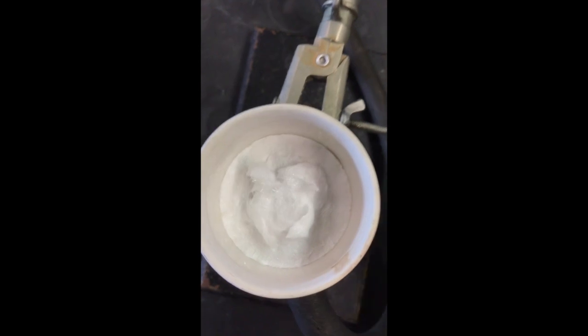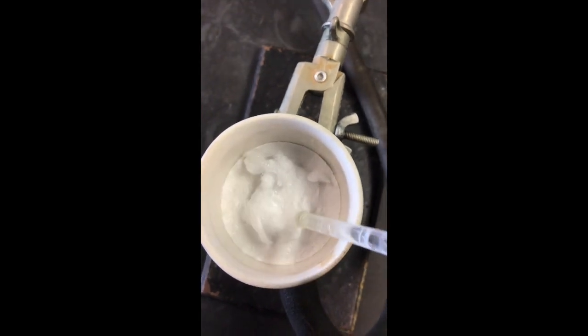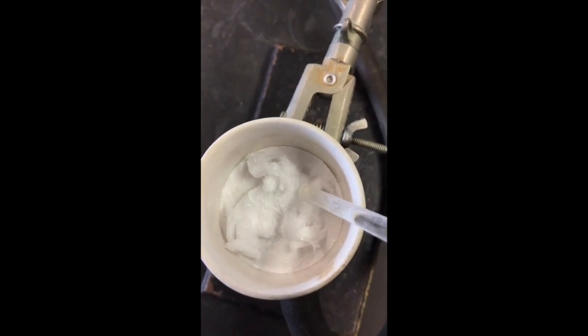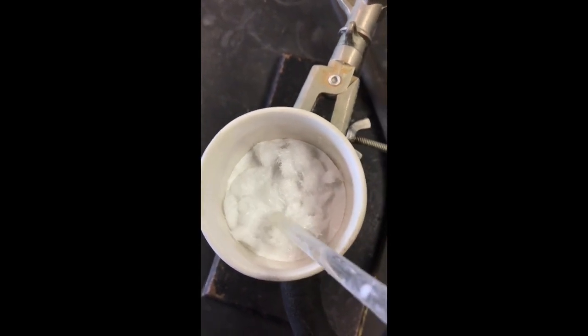But also when you're looking at your material anyway, it's always best to spread the material out so that we can get the ethanol sucked out of the material as best and efficiently as possible.